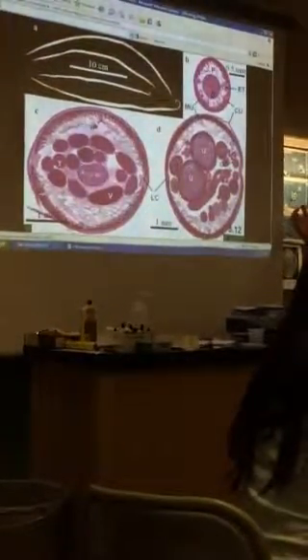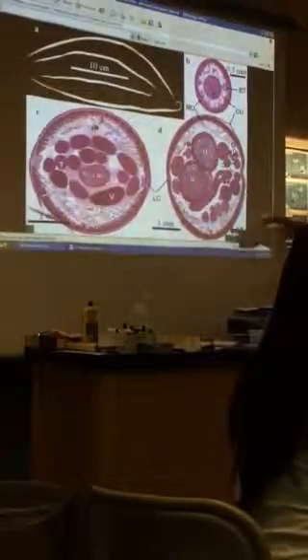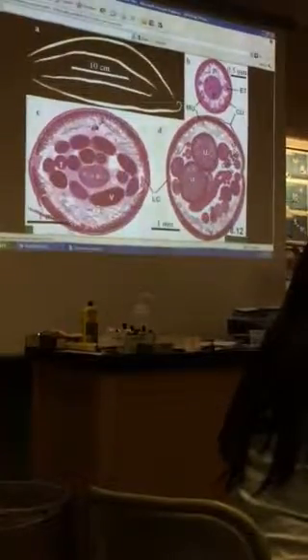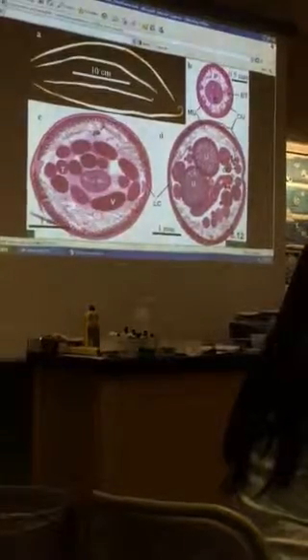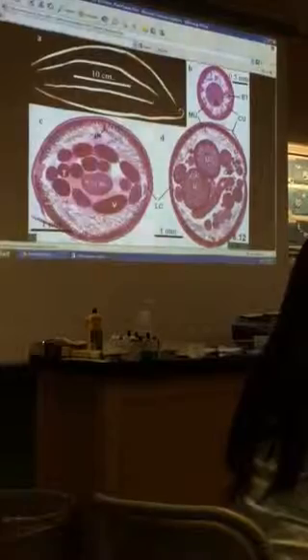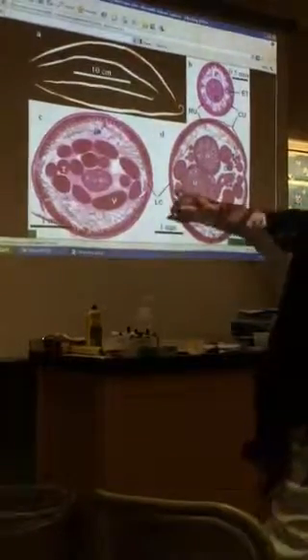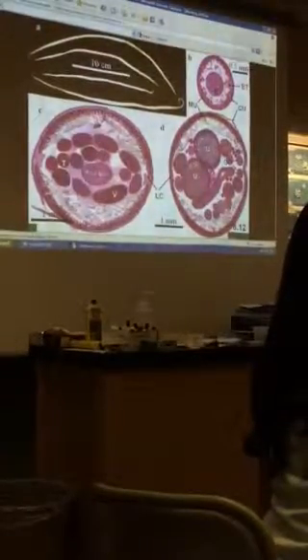Nematodes have a system of both dorsal and ventral and also two lateral cords that contain both nervous and excretory structures. You can find those cords on the cross sections, and they form these lateral line-looking structures you can even see from the outside of the worm. And this one doesn't show us the dorsal and ventral cord, and we won't worry about which one's which all that much, but try to find those cords. Lateral cords are probably more evident.